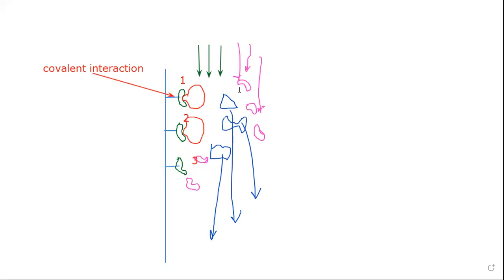And then if the red color molecule now binds to the pink colored molecule, let me show that. Okay, so the interaction is now happening like this. The red color molecule from position number 1 has come off and it is binding to the pink colored molecule. Because the pink colored molecules are in excess, there is great competition offered by them. And now this particular complex, this is a complex now.